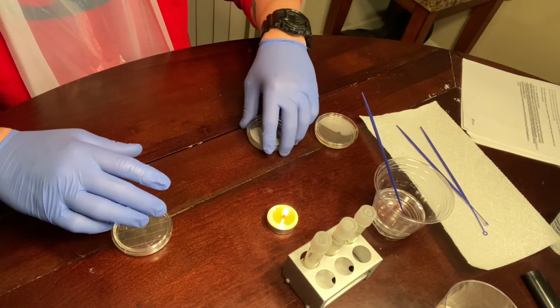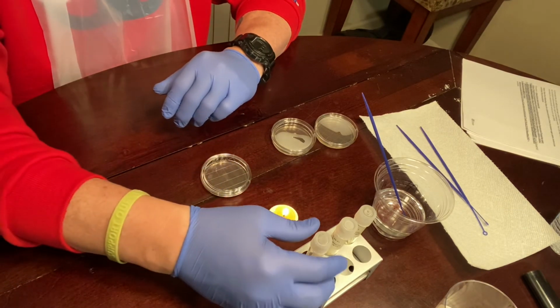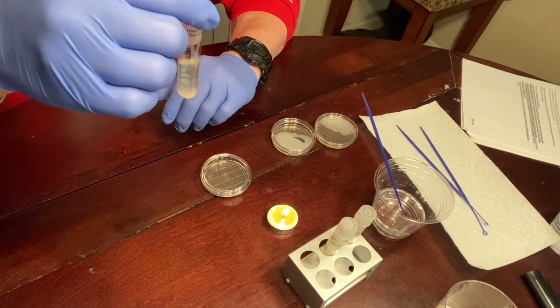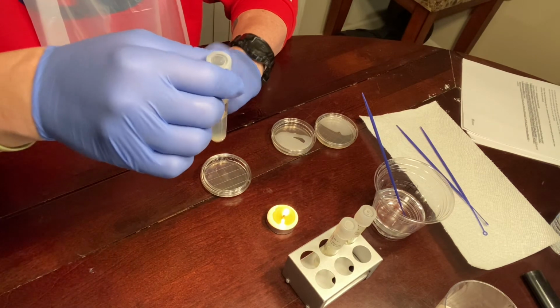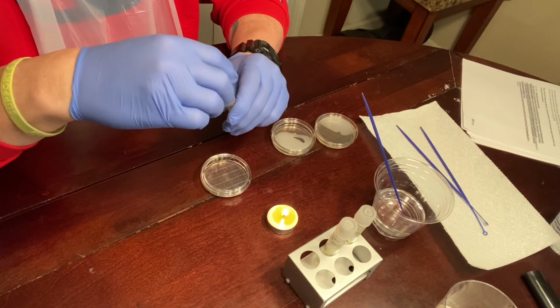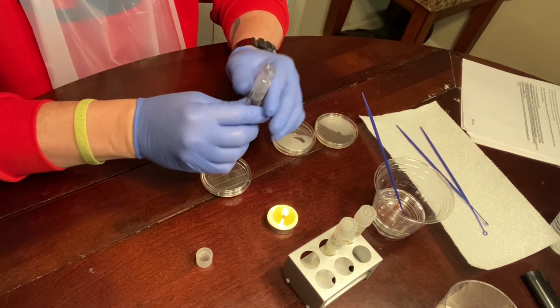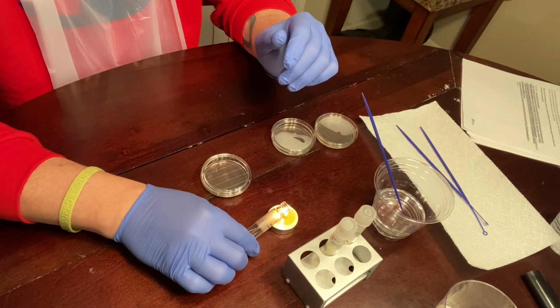Set this aside. And this is the S. epidermidis. And now I'm going to repeat the process for this one. Sterilize the rim.